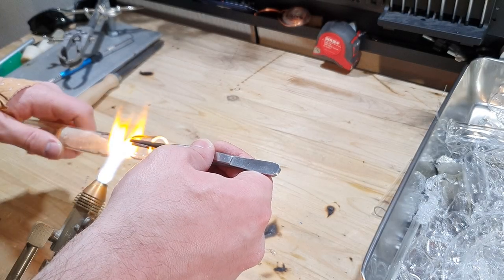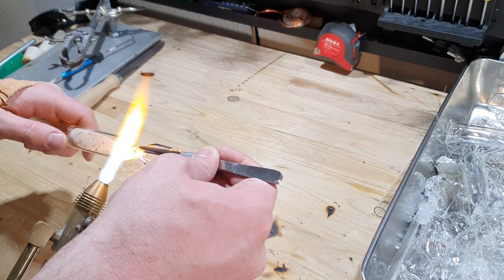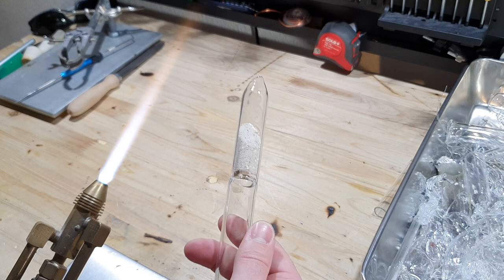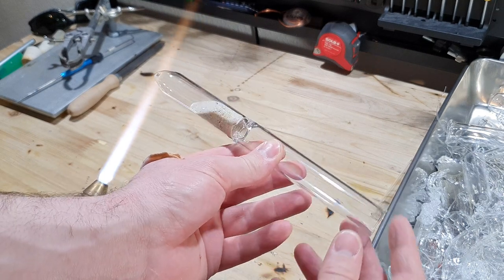You would now connect the ampoule with the neck to your still or to your apparatus with a vacuum connector, or melt it on there, and fill it with your product. For demonstration purposes I am just using sand, and after I filled the ampoule with sand I am sealing it with my torch.